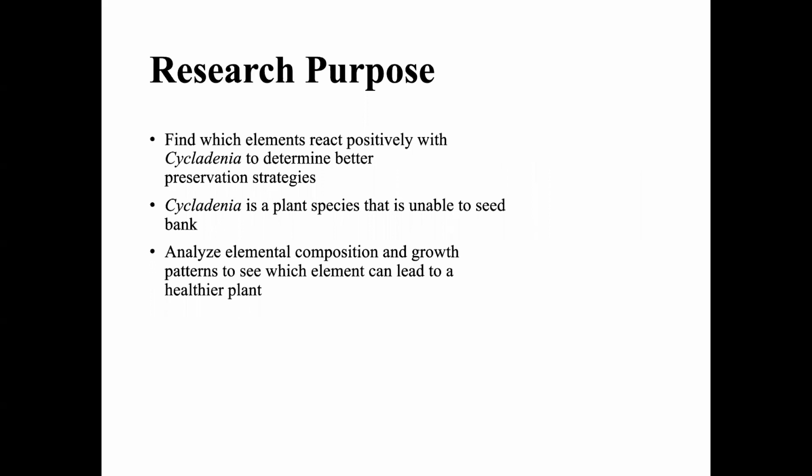For our research purposes, we are trying to find which elements react positively with the Jones Cycladenia to determine better preservation strategies. We're also trying to analyze the elemental composition and growth patterns to see which element can lead to a healthier plant, and one that could possibly be part of a seed bank, due to the Jones Cycladenia as of right now not being able to be in a seed bank.